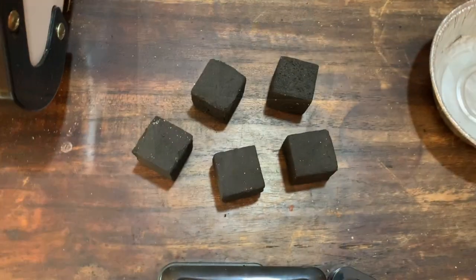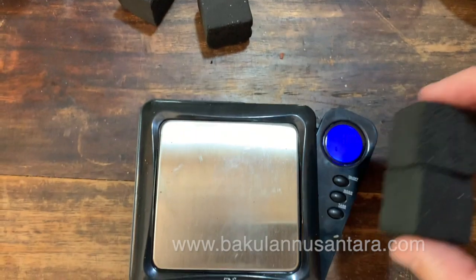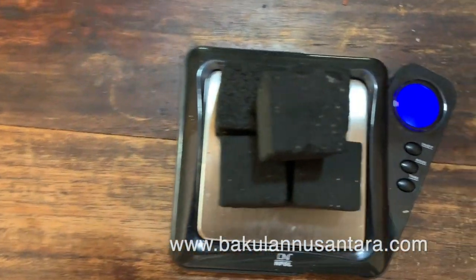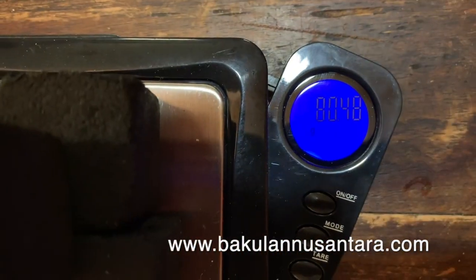We're going to measure the weight of five cubes. The more cubes you use, the more accurate your ash content will be. We put five cubes on the scales and measure the total weight, which is 80.48 grams.